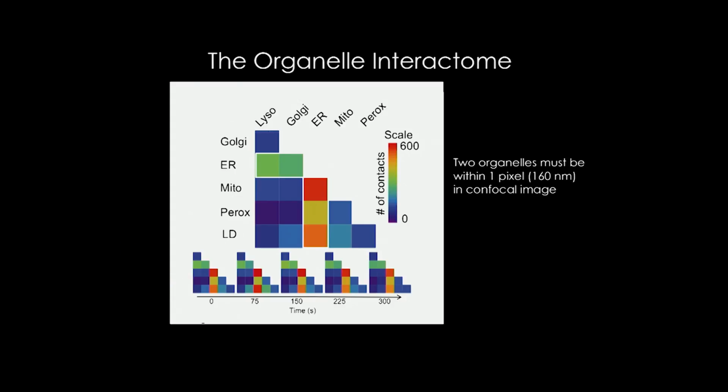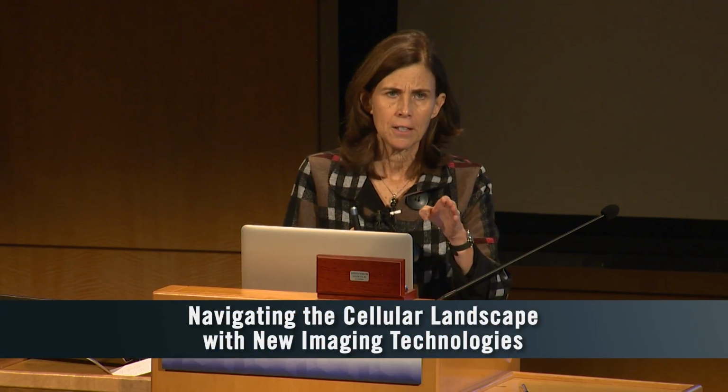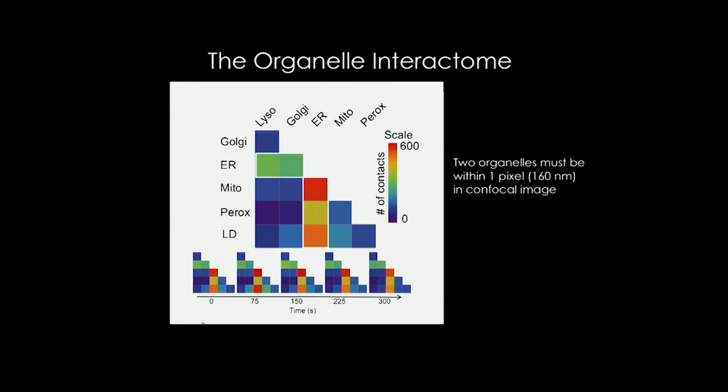Importantly, if you look at a single cell over time, you can see that this organelle interactome is conserved over fairly significant periods of time, and that is despite the fact that any particular contact that we see is relatively transient. I should emphasize that this interactome changes dramatically if we perturb the cell in different ways. We can depolymerize microtubules or starve cells in different ways, and we dramatically change the way these organelles are interacting with each other.